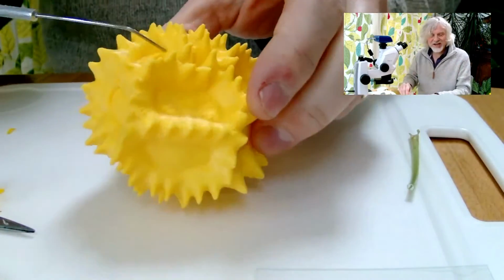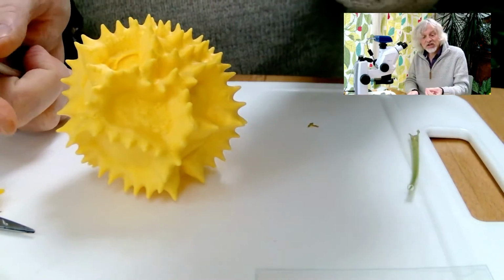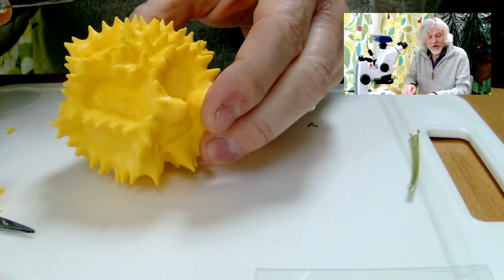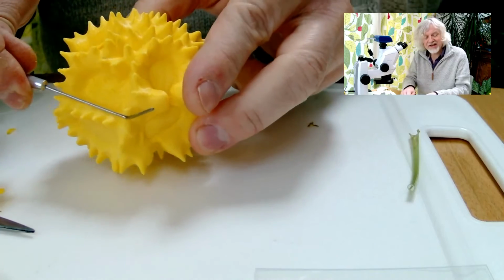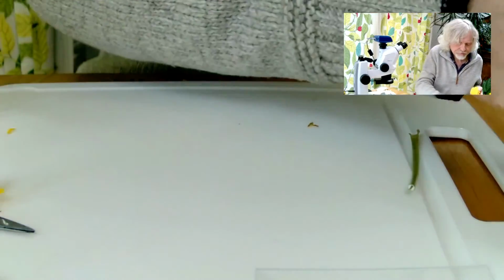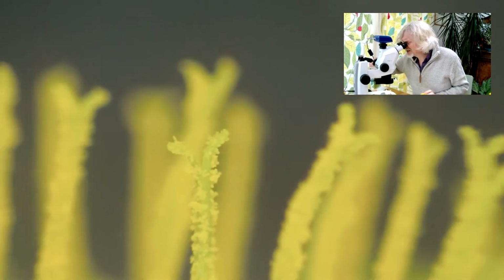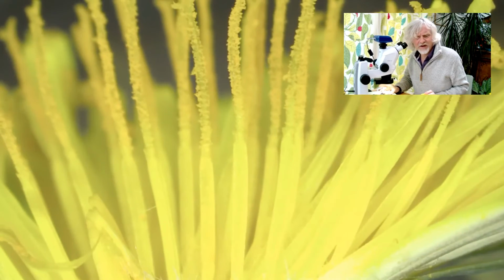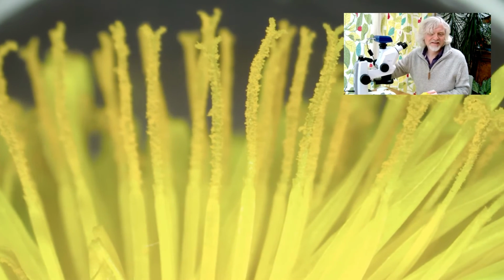And it's interesting because you see all these spiky bits on it. What that means is that, number one, it sticks to those vertical surfaces, the stigma, more easily. But also, if there's any hairs on a bee's leg, for example, it'll hook onto the spikes and get caught on the bee's legs and carried away. So if I zoom out again so that we can see this in all its beauty, there it is. All those individual florets covered in pollen. Aren't they good?